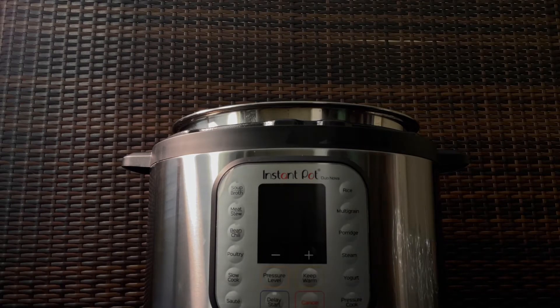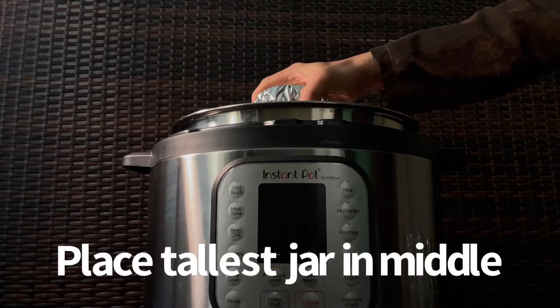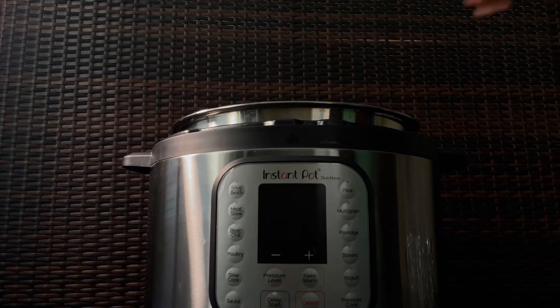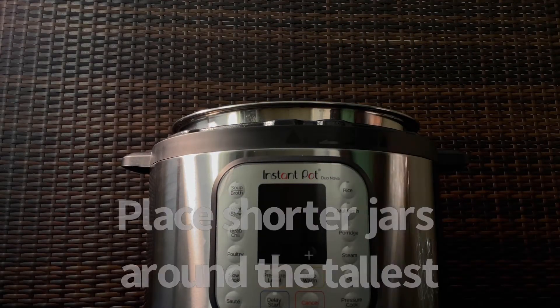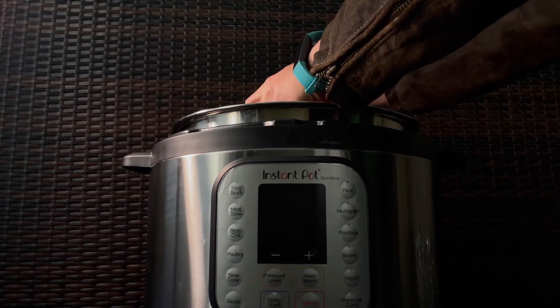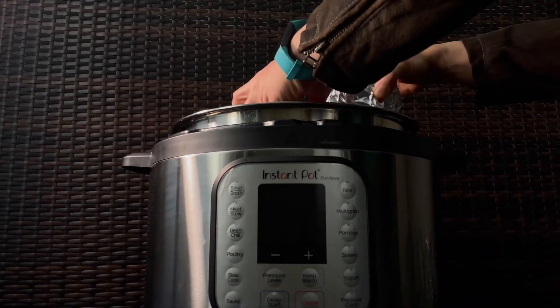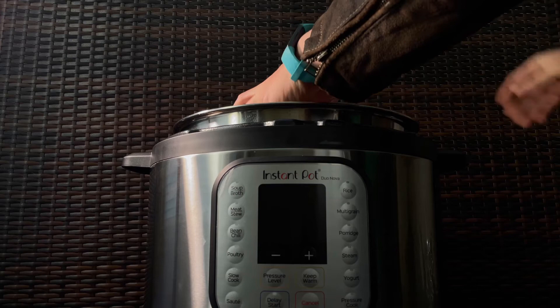Next, place the foil-wrapped grain spawn jars in the Instant Pot on top of the trivet. Place the tallest one in the middle and the shorter jars around. I find that this is the easiest way for the Instant Pot to close and hold all of the jars.